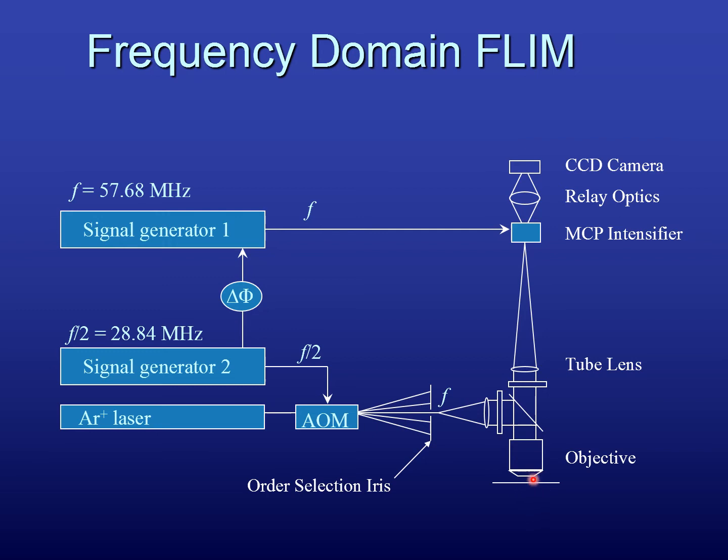Now the sample takes that intensity and responds to it by convolving its fluorescence lifetime decay curve over time with that excitation intensity. So if you convolve a sine curve with anything, it will remain a sine curve. And we are convolving the sine with an exponential decay that starts at time 0. And so what will that lead to? I will show you that in a second. And the light then goes back.